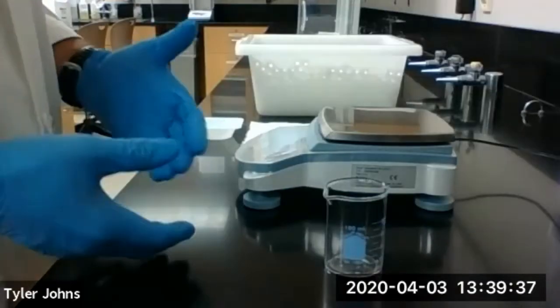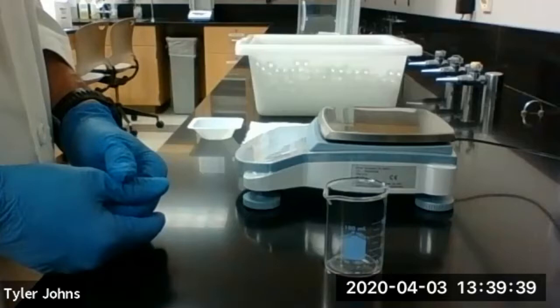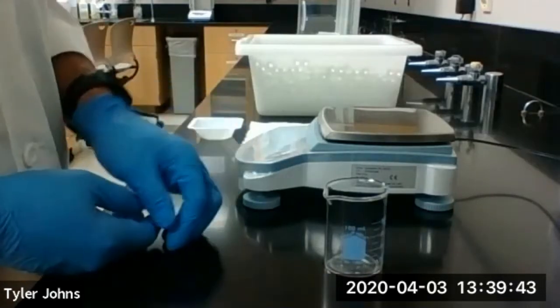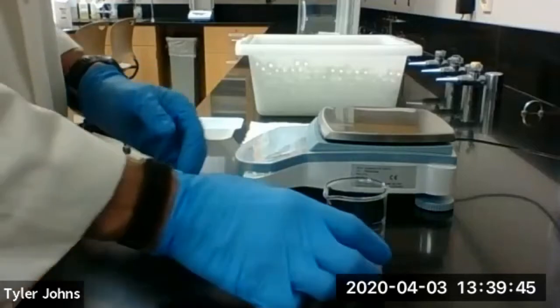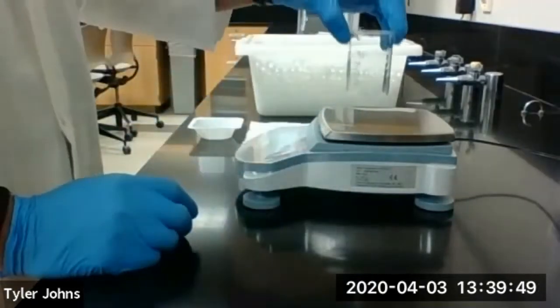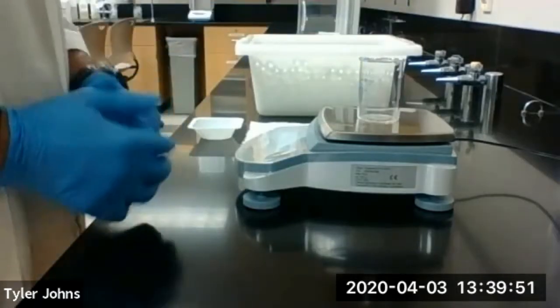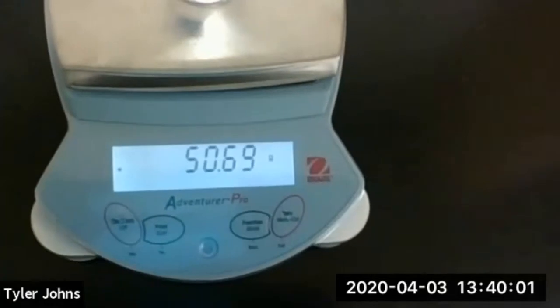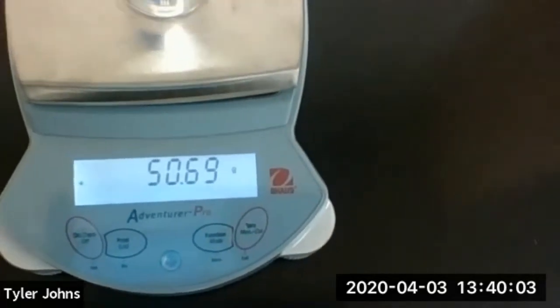So in part A of this experiment, we're first going to count by mass using marbles. So we're going to determine the mass of an empty 100 ml beaker. This is our empty 100 ml beaker. The mass of our 100 ml beaker is 50.69 grams.